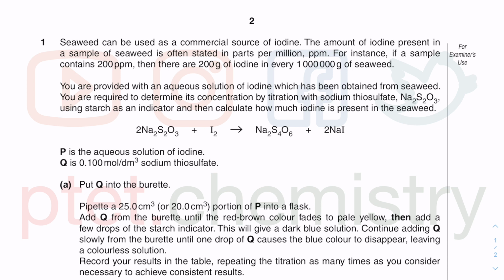So in this tutorial video, I'll be covering something similar to the last practical tutorial video. This is iodine thiosulfate titrations. So this is iodine, which is some sort of brown solution. Iodine is not very soluble in water, but when it is soluble, it has this brown color. So this is the sodium thiosulfate. It has the S2O3 2- anion there.